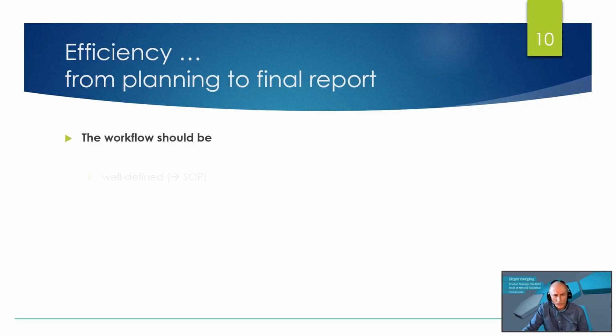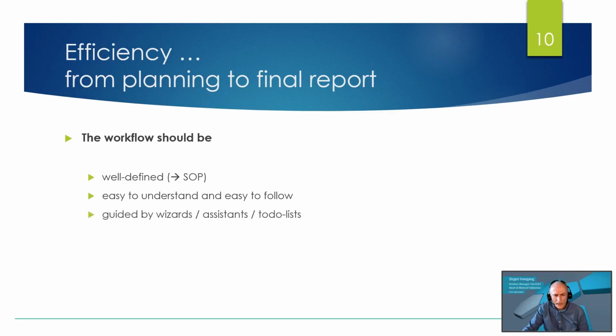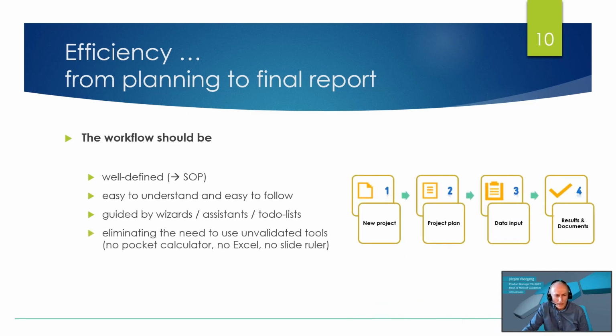The workflow should be well defined. This should be done in your SOP document. Easy to understand and easy to follow. Guided by wizards, assistants, to-do lists. Eliminating the need to use unvalidated tools. So no pocket calculator, no Excel, no slide rule.